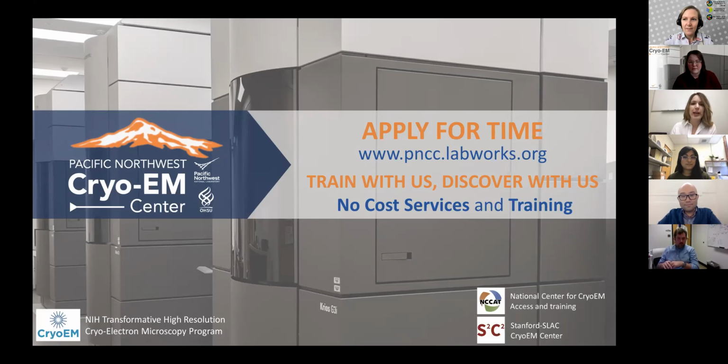We currently have 5 microscopes, an Arctica K3, and 3 Kriosess with Falcon 3 K3 detectors, 2 of these with BioQuantum K3s, and 1 Krios with a Falcon 4 BioContinuum K3. And 3 of these are now offering fringe-free imaging.